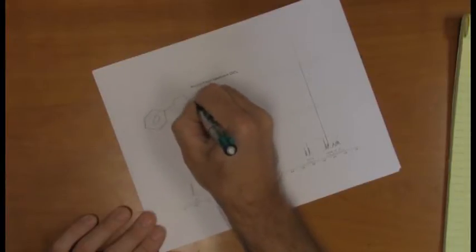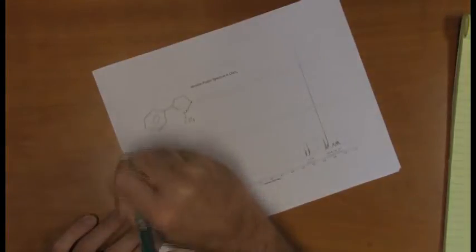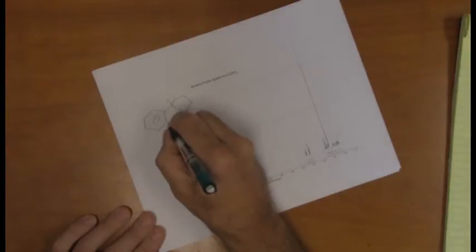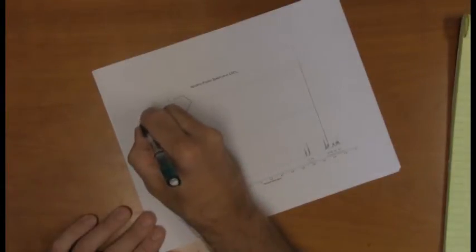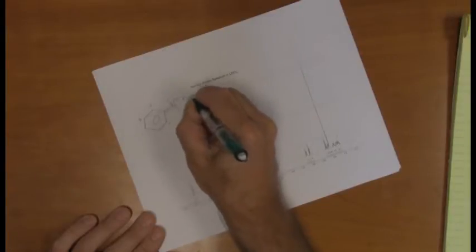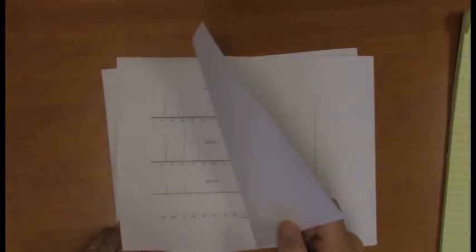CH3, and I specifically tell us about that position there. And that's position 1, 2, 3, 4, 5, 6, 7, 8, 9, 10. Okay, and what I'm going to do is repeat that for the proton, for the carbon, for the DEPT 90, or for the carbon DEPT 135.